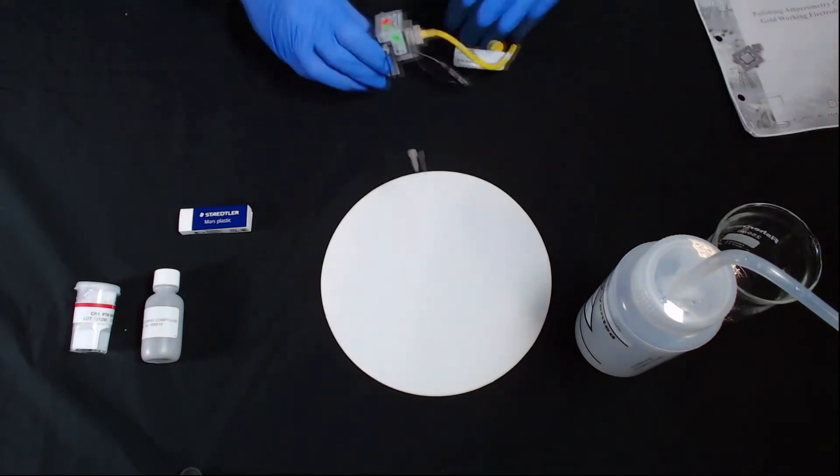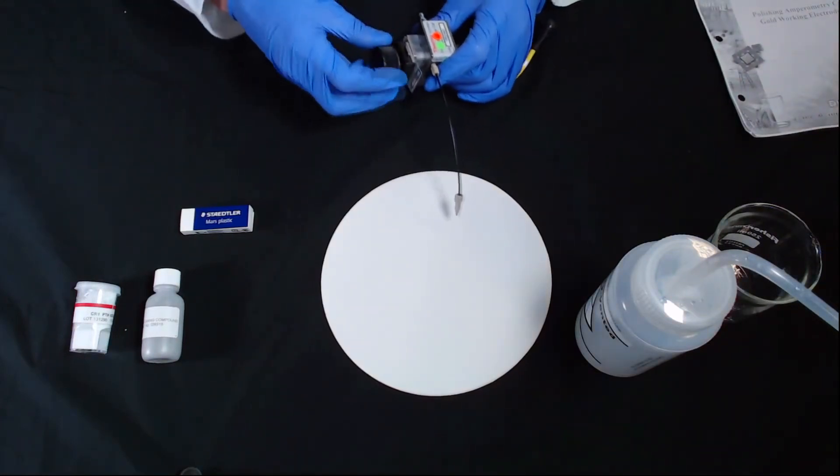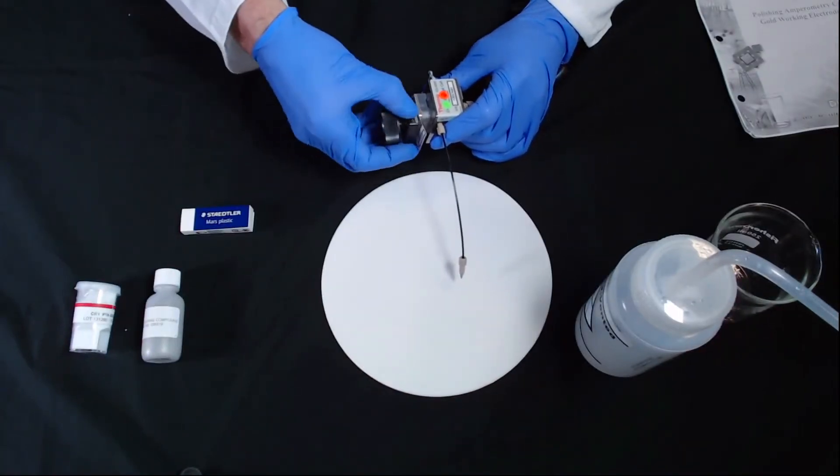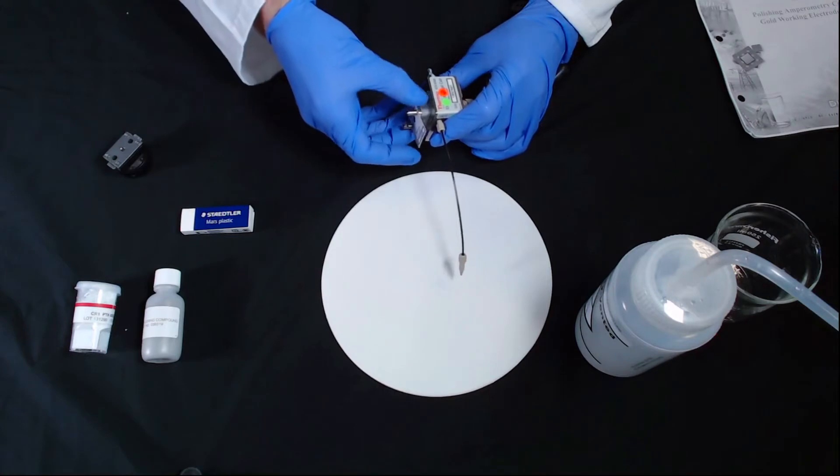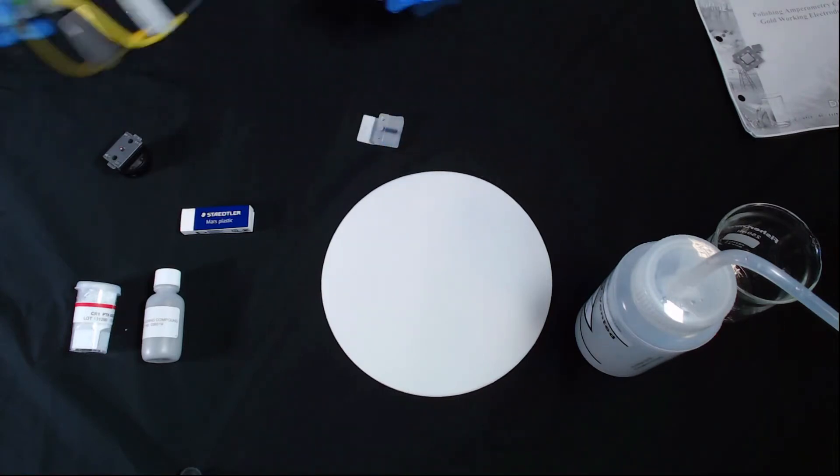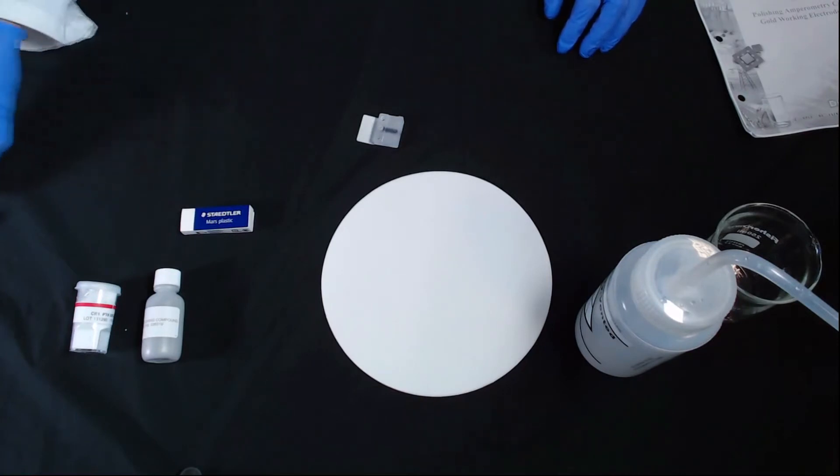To get it polished, first we need to disassemble the cell. We're going to remove the yoke knob and take the working electrode off. I'll put the cell out of the way.